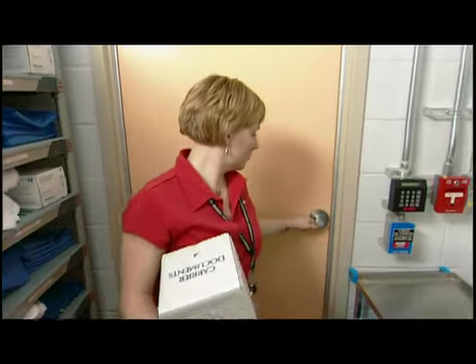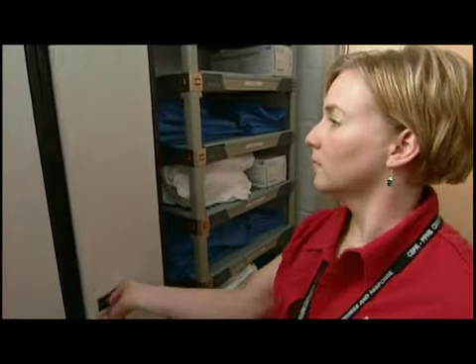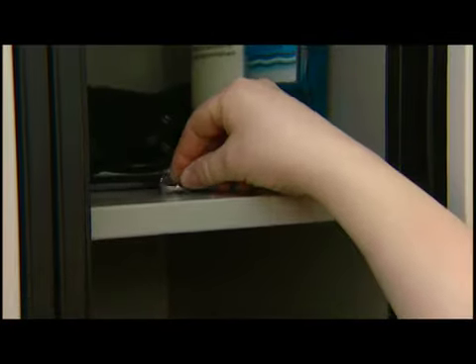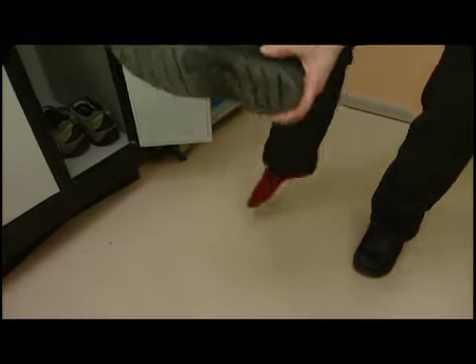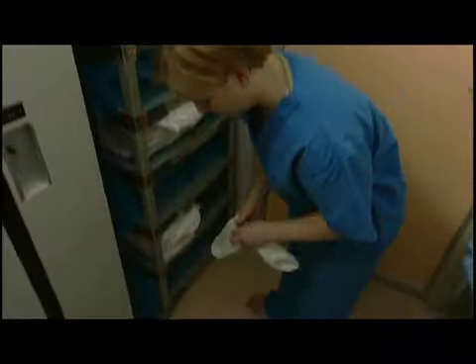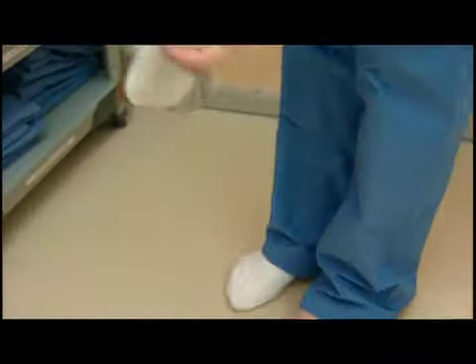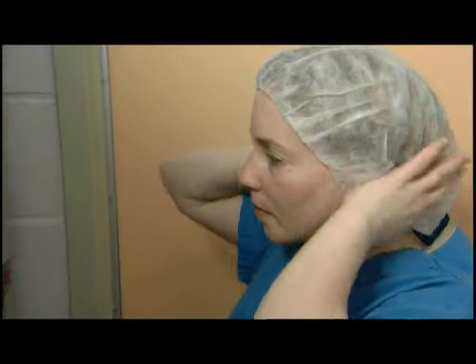Pathogens in a Containment Level 3 lab usually pose an increased risk of aerosol spread. To reduce the potential for transmission of these pathogens, you have to remove all your street clothes, including jewelry and socks, and change into dedicated laboratory clothing or scrubs, including clean socks and head cover. Whether you are required to remove your undergarments depends on your facility's SOP.